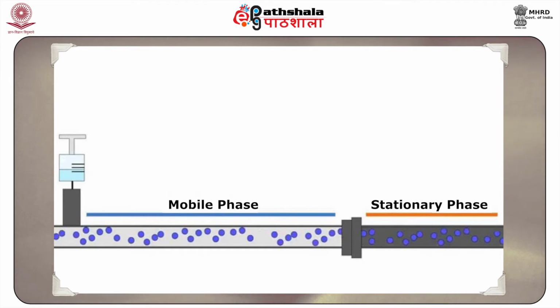The various components of a mixture get separated on the grounds of their differential affinity towards the stationary phase. The pressurized mobile phase could be a mixture of solvents like water, acetonitrile, or methanol. Its temperature and composition are the chief influencing factors of this technique.